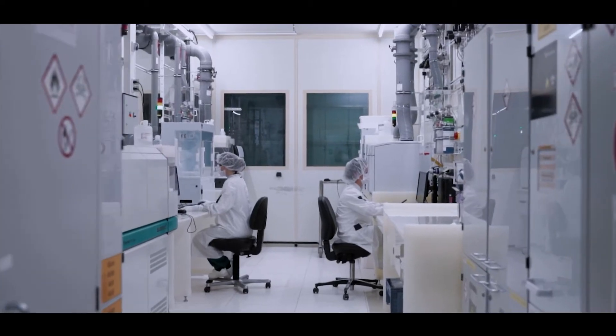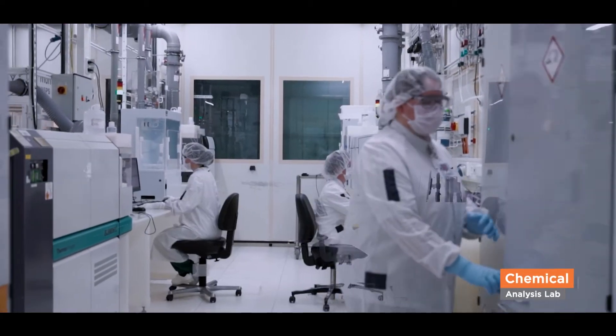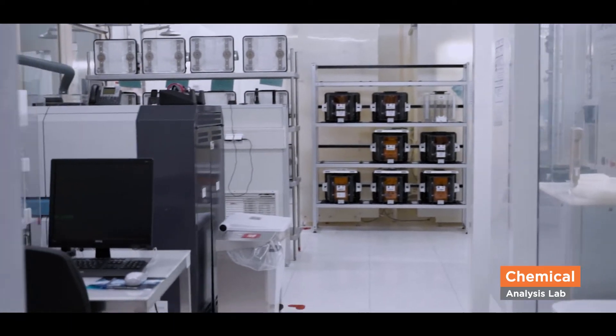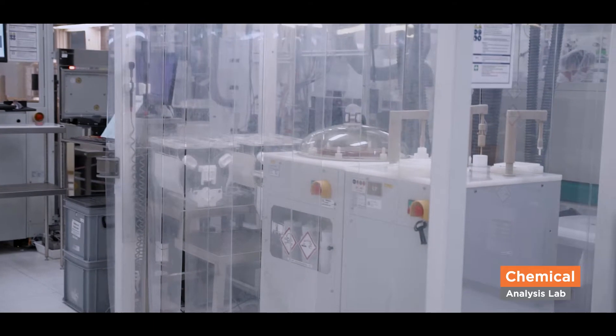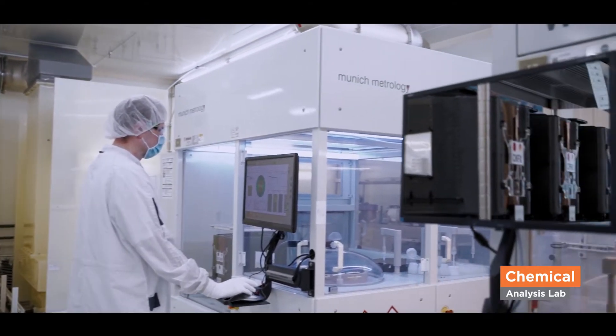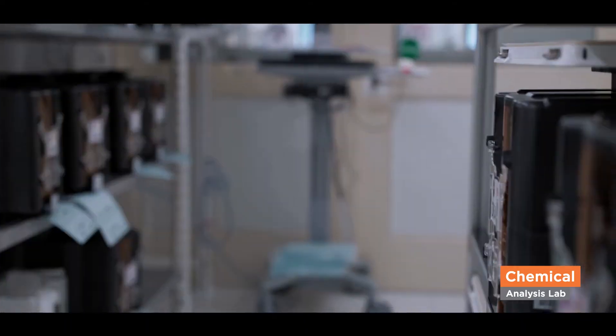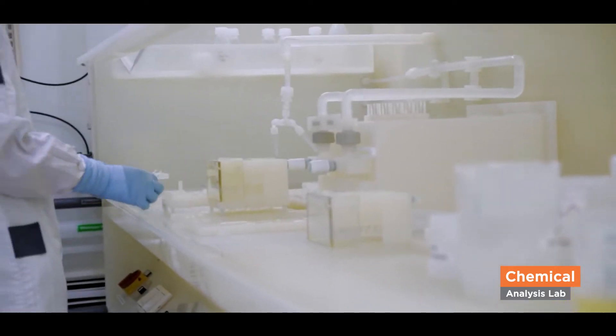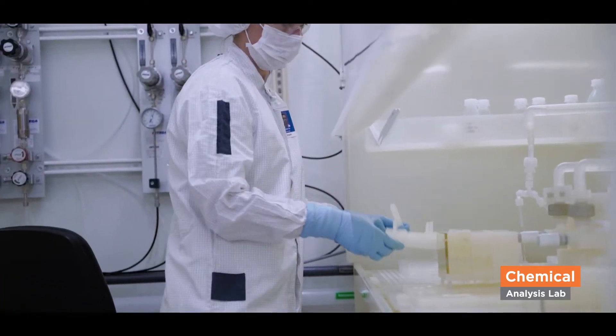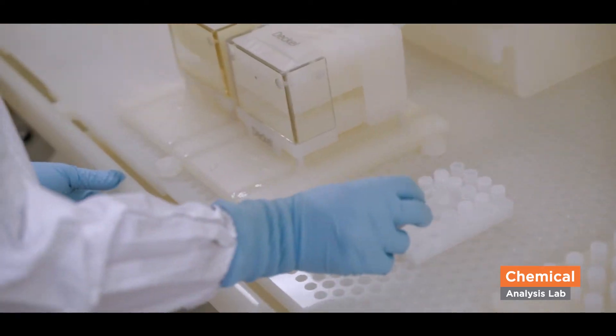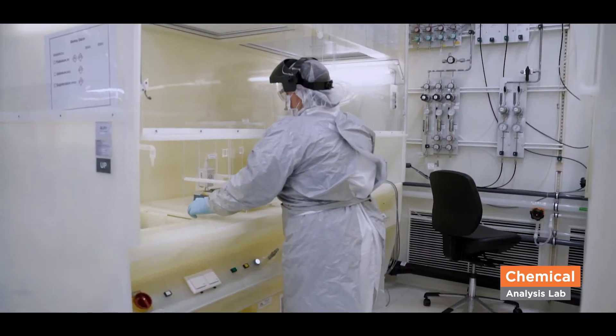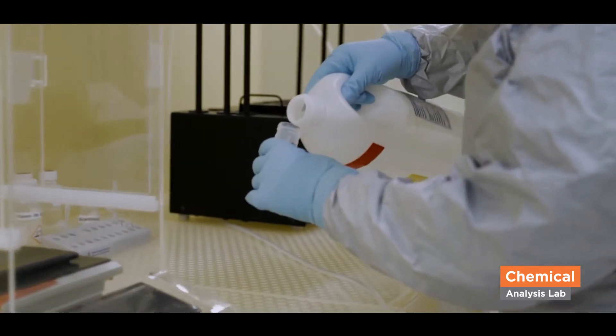Welcome to the chem lab. In this lab, we support mainly the production and facilities departments with various short-term chemical analysis. One main focus is to check the cleanliness of the chemicals and tools used for the process. After sample preparation, the chemicals are checked with our very sensitive ICP-MS mass spectrometers for contamination in the parts per trillion concentration range, which means a nanogram per liter concentration.